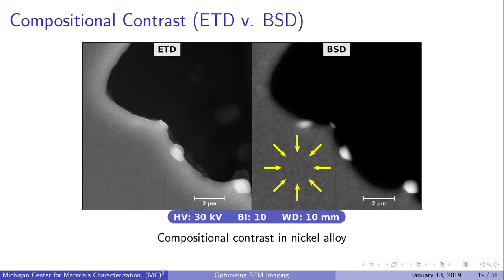Heavier elements appear brighter in the BSD compared to lighter elements. Zooming in on a nickel alloy, we can see compositional contrast with the BSD—the lighter regions are secondary gamma prime particles, which are composed of heavier elements on average than the darker matrix.